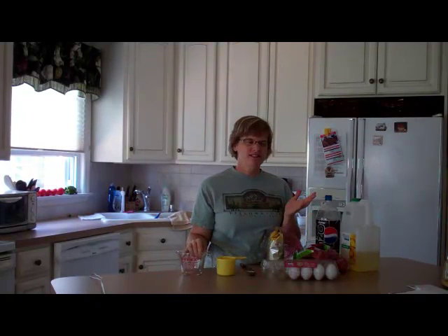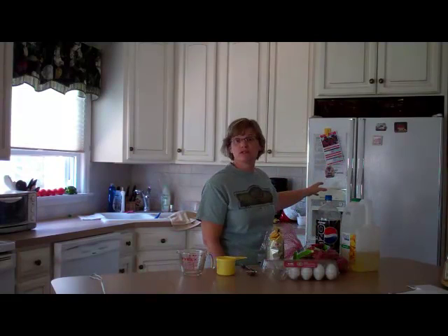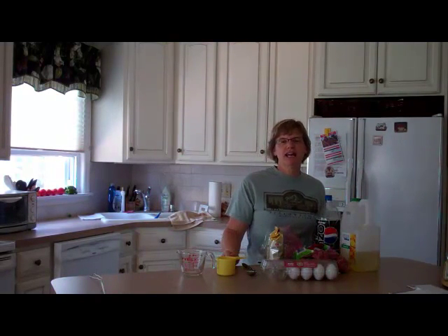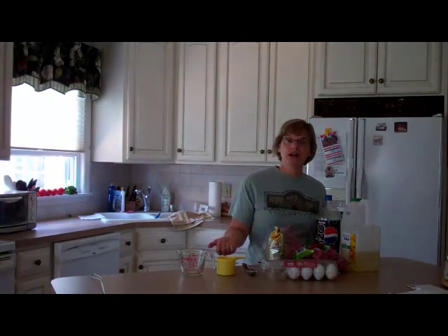When you work in the kitchen, you do a lot of measuring all the time. Even the temperature on the oven and the temperature on the refrigerator has to be measured. But how do we do measurement in the chemistry laboratory? Things are done a little bit differently, but not a whole lot differently. So let's take a look at how you're going to measure length, volume, and mass.